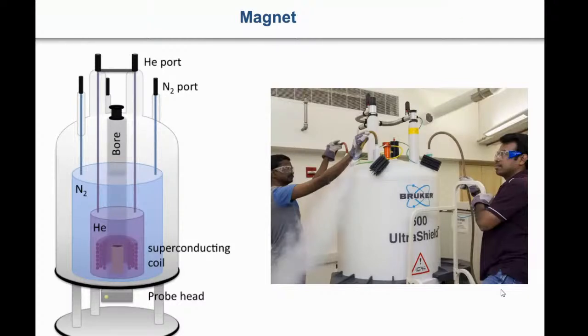So you have to open up the exhaust so that the gases go, the pressure leaves. So you put this transfer line into the liquid nitrogen, and then it comes here, it goes into here. And the excess pressure and the liquid nitrogen comes out on the other side. Okay. And finally, when the filling is over, you get liquid nitrogen coming out here. Previously, only gases will come before the filling. When liquid nitrogen comes, there is a spurting. Spurting, that means liquid is coming out. Then you stop the filling.